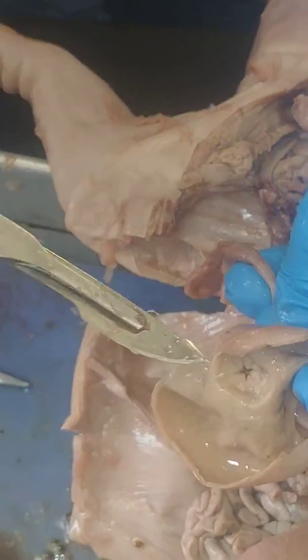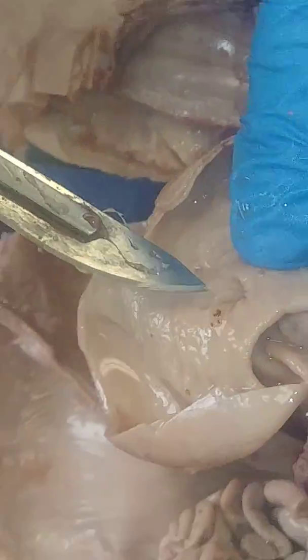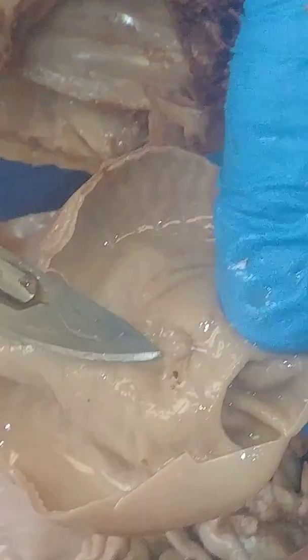Okay, and there is the pyloric sphincter. That little band of muscles almost looks star-like, but that stays nice and tight, keeps food in the stomach till it gets broken down into a real soupy mess. Then it'll let it go to the small intestine. On the other end up here, this is the cardioesophageal constrictor. It's another little band of muscles, and that's what keeps food from going back up your throat.